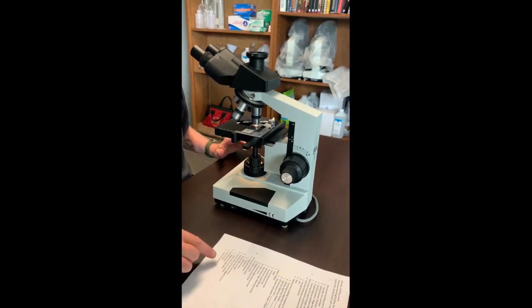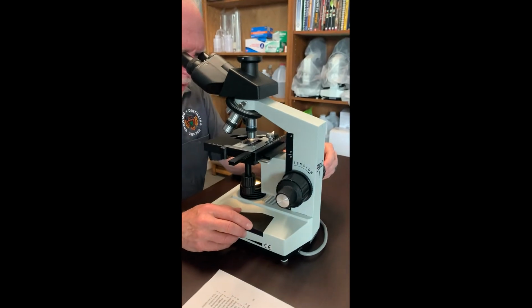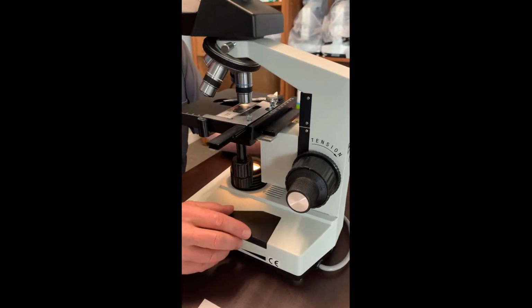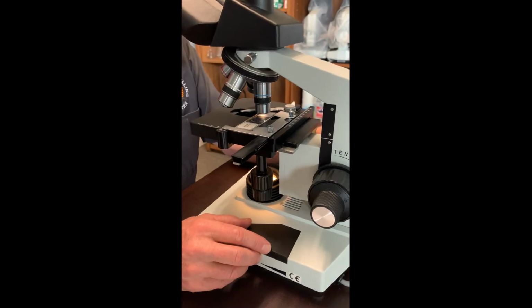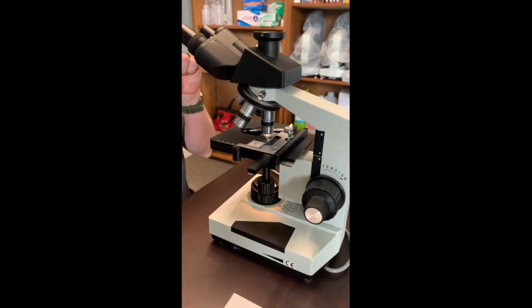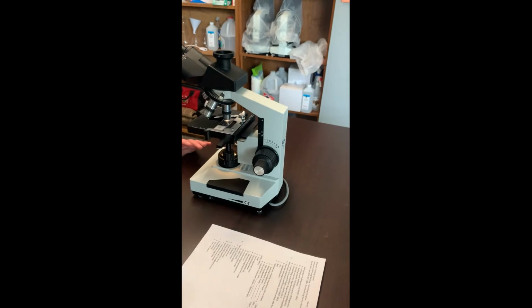Let's see what else. I know that I've got this in focus because it's blue, but I may be looking at something that doesn't really stand out in color. It may just be a beige or some color that's not really obvious, and I'm not 100% sure. To make sure that I've got my object in focus, use an object which is on the slide.